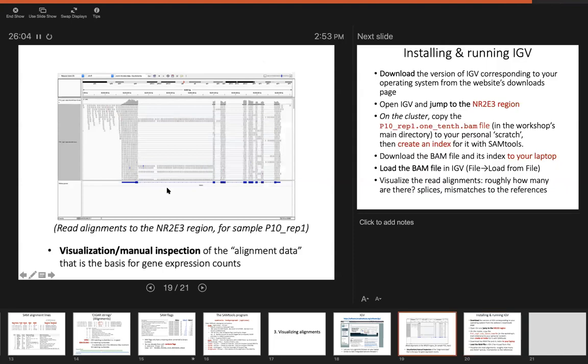I think that you open your IGV and put in the BAM files, and how you create the BAI index and put the BAI also, and then load the alignments inside the IGV. Okay, so I can demonstrate how it's done.